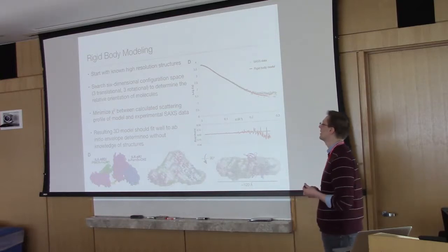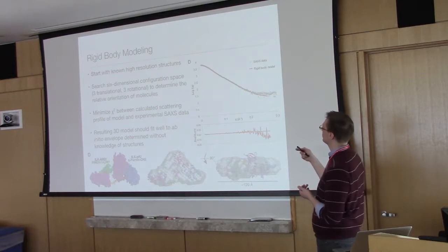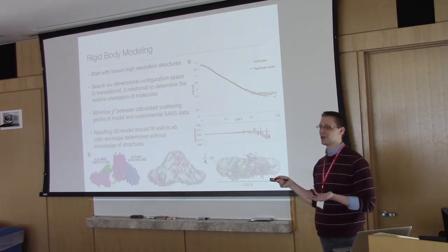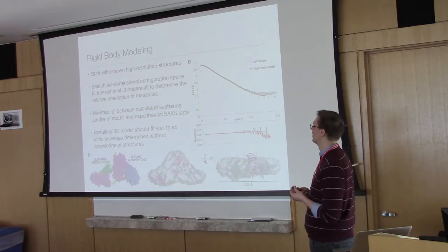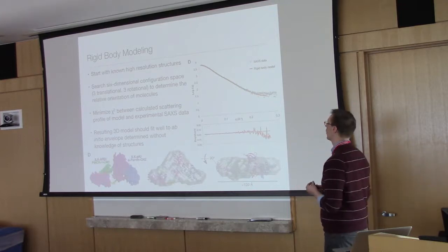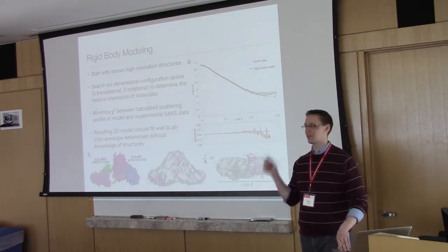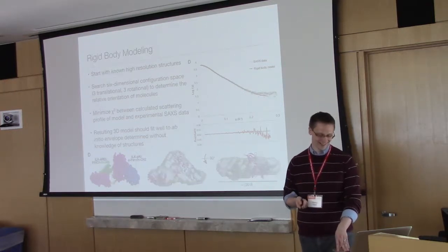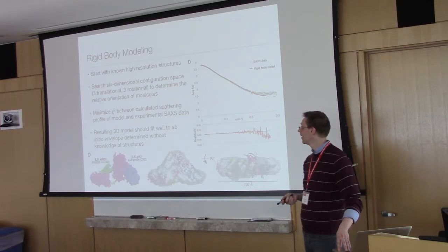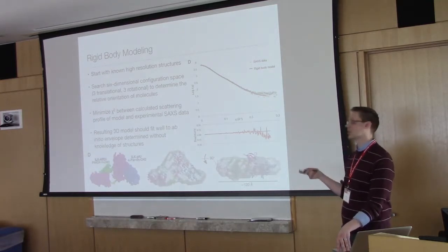Yeah, sure, because it just depends on how your errors are calculated. Yeah, I mean, plus a lot of times you'll get a bump out here, and all of a sudden everything's off by an order of magnitude for that bump, and it screws up everything. There are better, more statistically robust ways than just chi-squared, but that's more advanced. There are papers on accurate calculations. It's important to always do this, and it's one of the reasons why ab initio envelopes are actually useful.